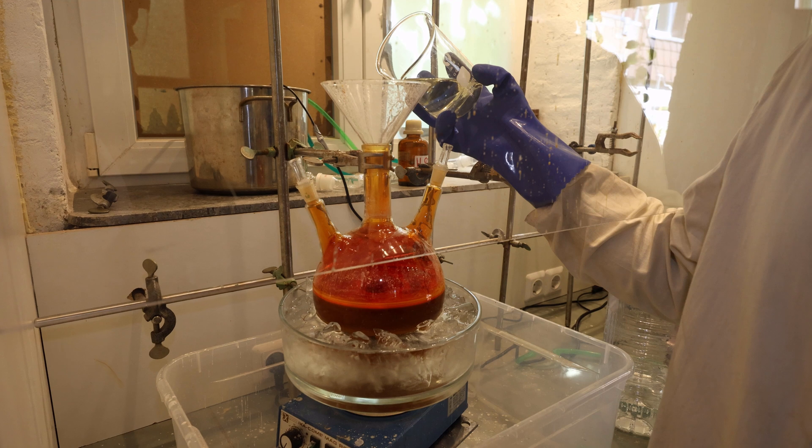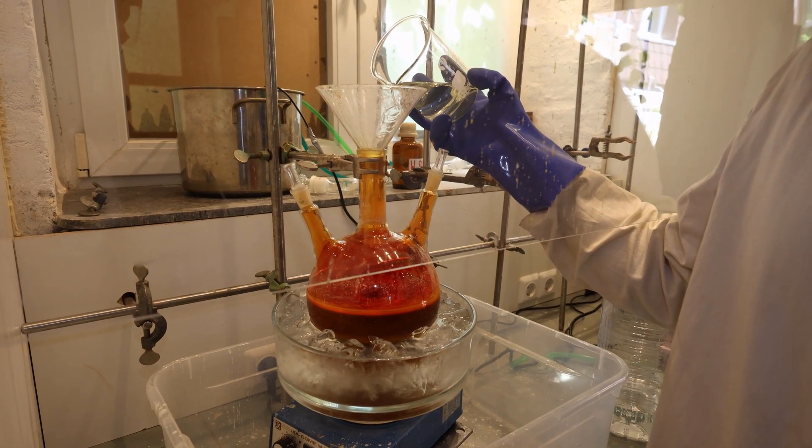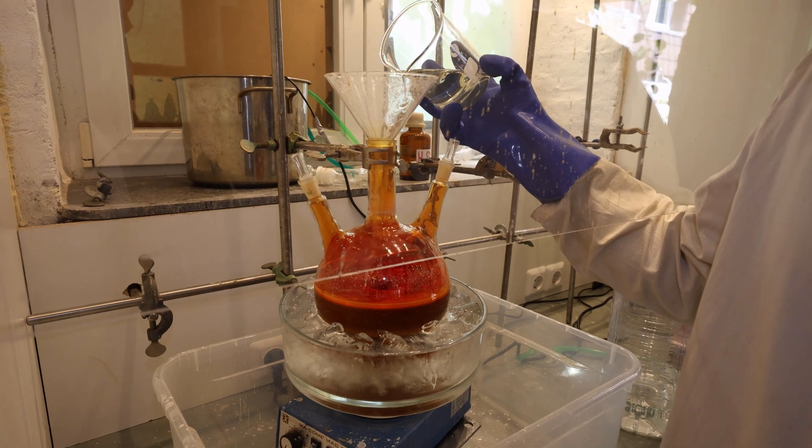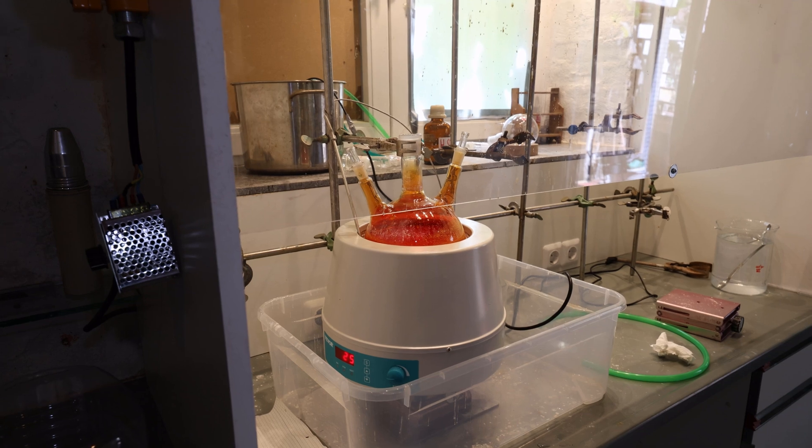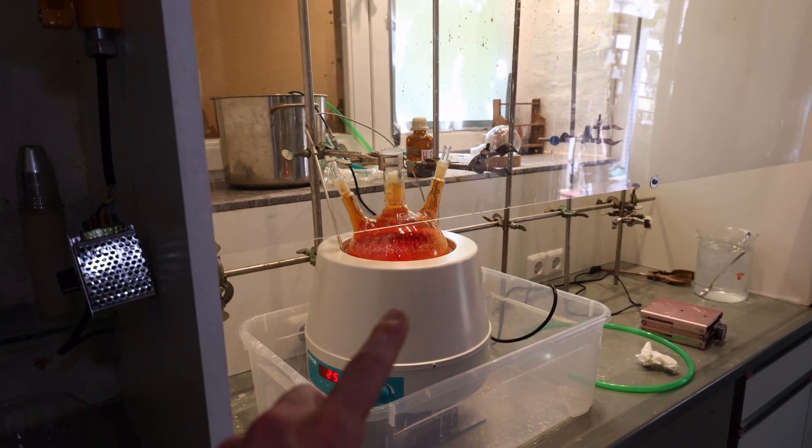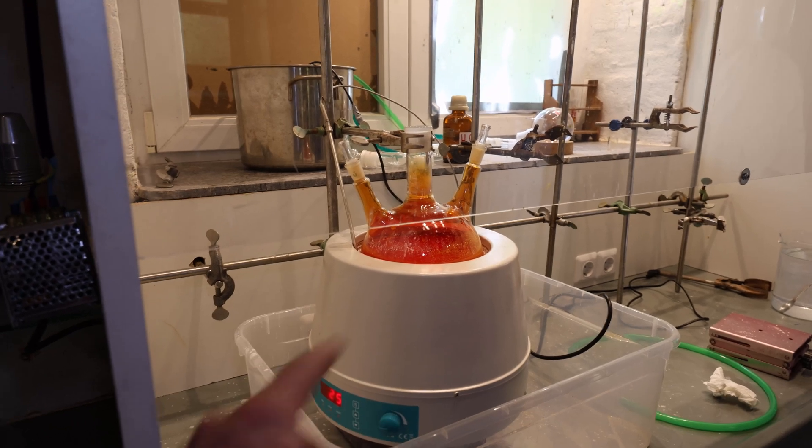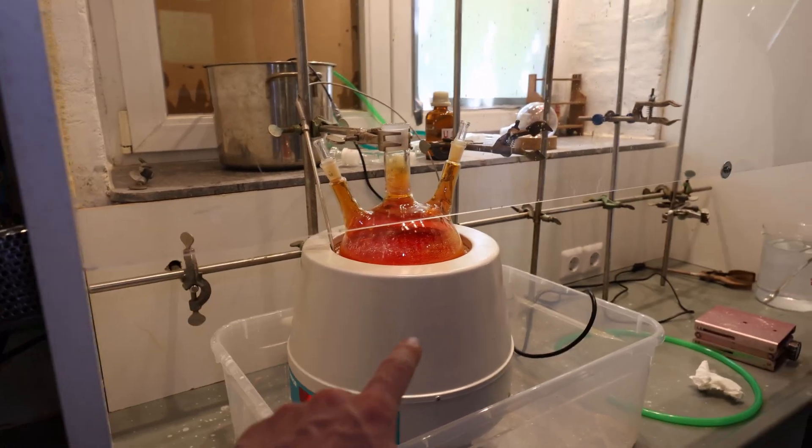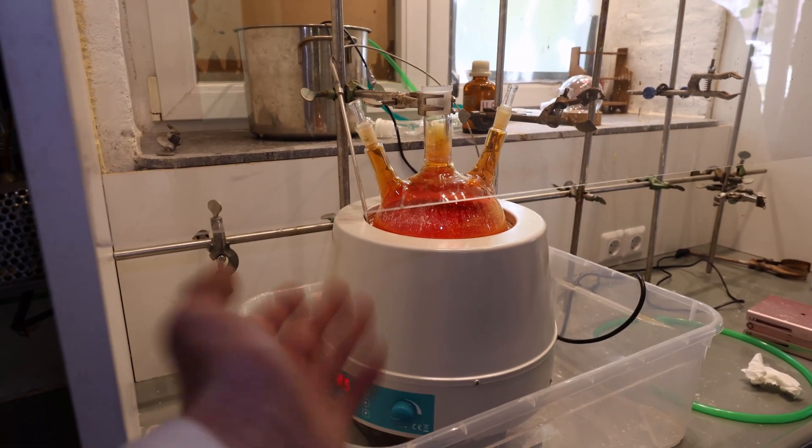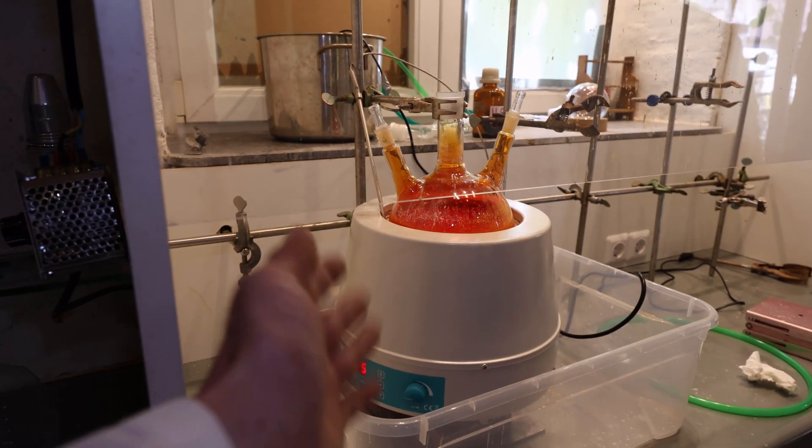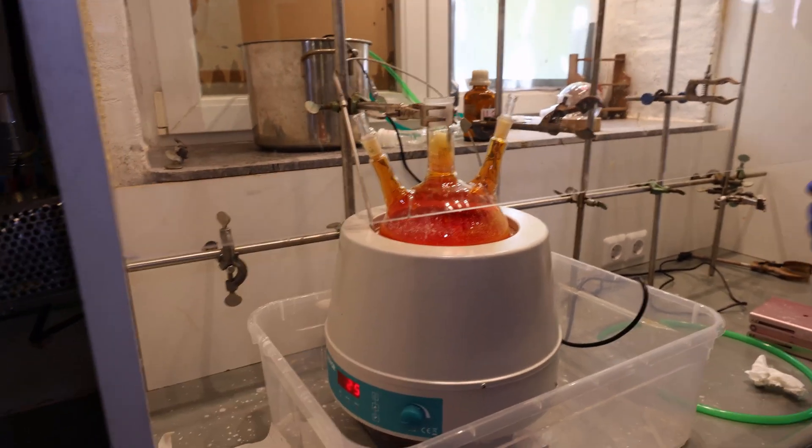Slowly adding the rest of the hydrochloric acid. We swapped the hot plate for a heating mantle. The hot plate was just for stirring because the stirring is not very strong on this one and better on the hot plate. This one is actually for heating now and now we're going to set up a distillation and distill over the bromine.